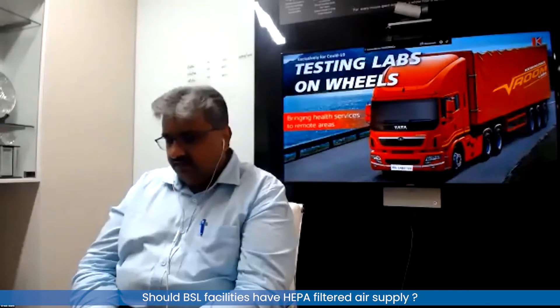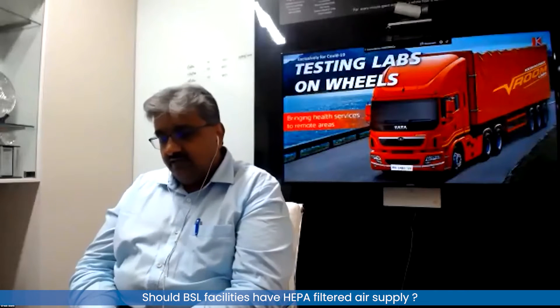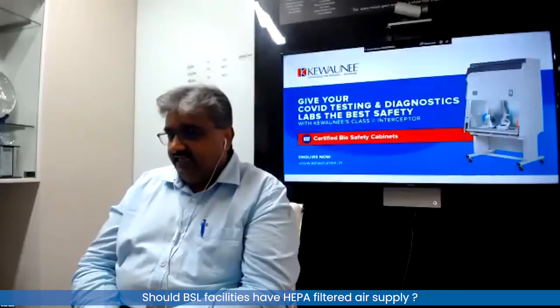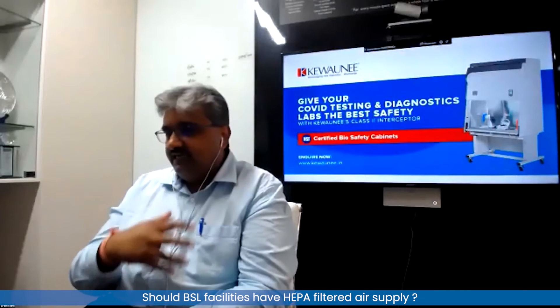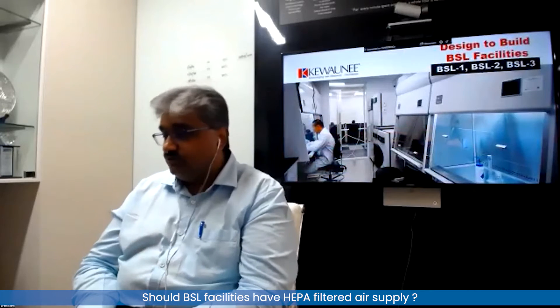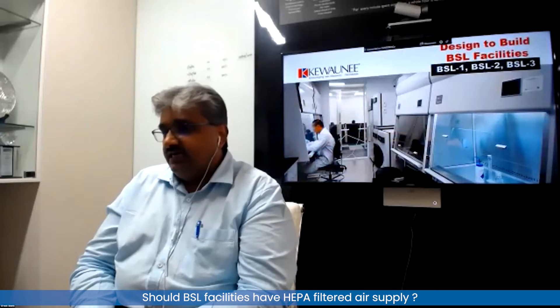For BSL3 and BSL4, it is good to have HEPA-filtered dates applied, because you are then preventing the sample from getting contaminated, or the people getting contaminated from the general flora present in the air. The air which is going to get sucked in through an A2 is also going to be contaminated with the species which are around.